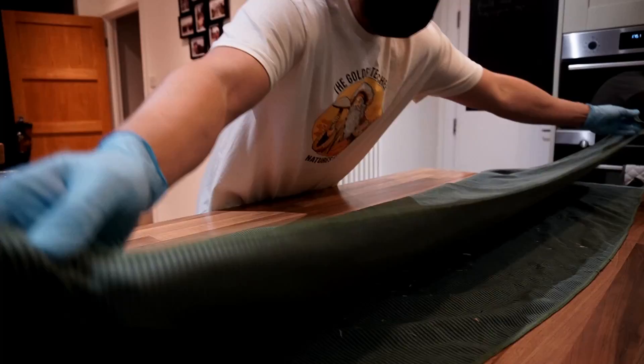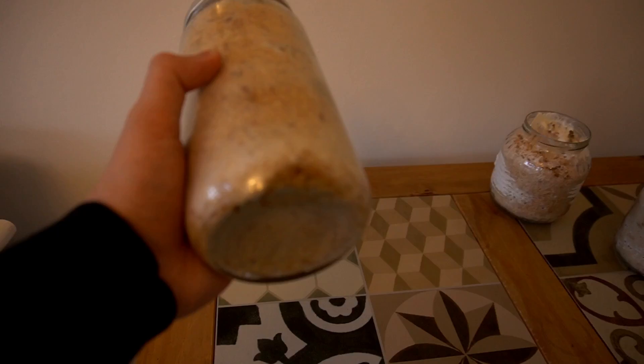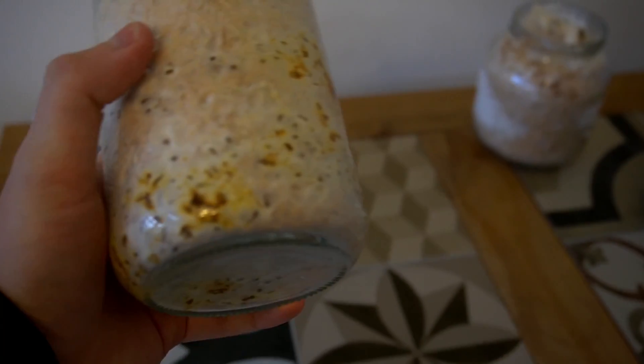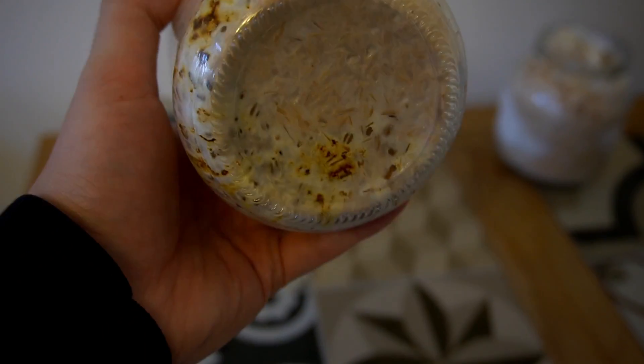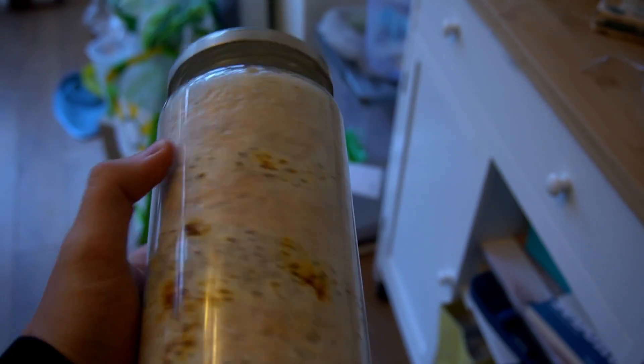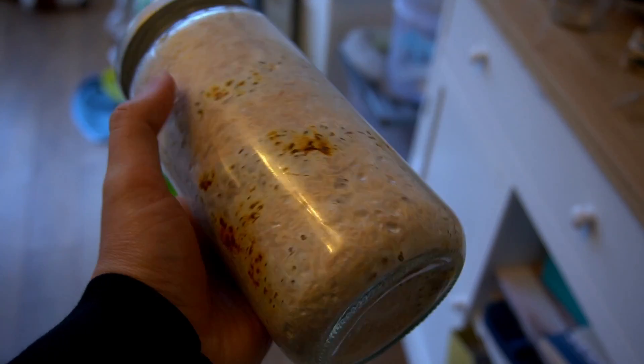Put your jars into incubation conditions and they should be colonized within about 14 days, but it's dependent on what kind of mushrooms you've grown. What you're looking out for is any areas where the mycelium hasn't completely taken over the substrate. If you can see a corner where the mycelium is not growing through, it's likely contaminated — don't bother trying to fruit it, just get rid of it. This jar looks fine; the mycelium has grown right through all of the substrate.